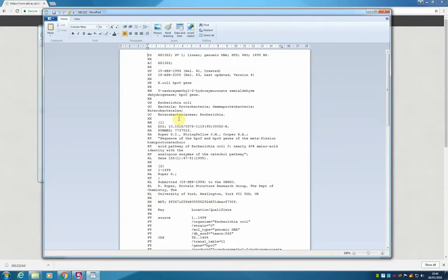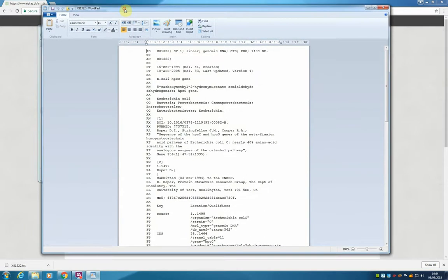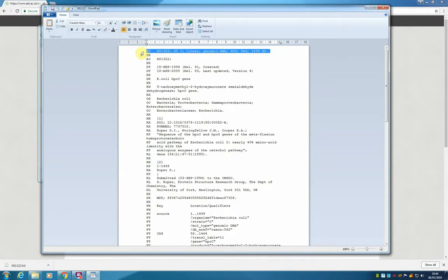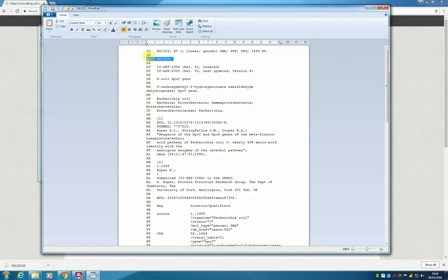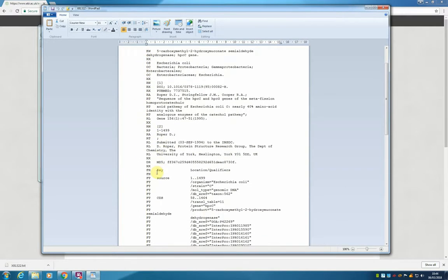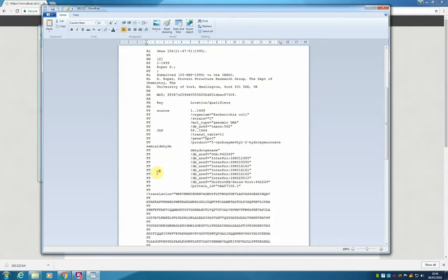And this is our entry. This is equivalent to the gene bank entry that we downloaded earlier. And all the same information is here. It's just encoded slightly different. So instead of having all the words such as accession or PubMed, we have just two letter codes. But the same information is there.